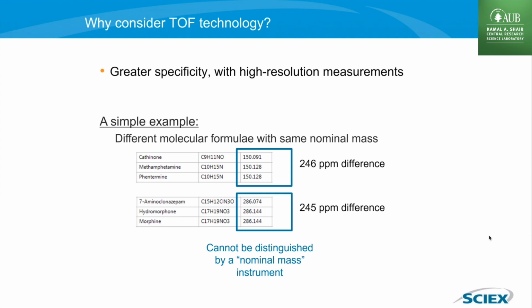But we can also go the opposite way, and this is perhaps the more interesting way for you guys working in more research-oriented work, is that you take the data from the instrument and you want to know what is the formula of that peak. So we would say that's the non-targeted way. Another way of thinking about that is formula finding.